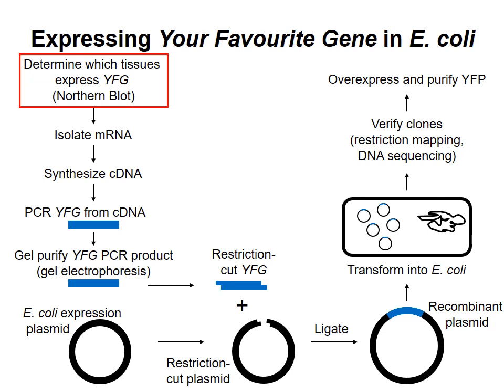So instead of trying to clone the DNA, it's a better strategy to clone the mature messenger RNA after the introns have been spliced out. Therefore, we want to find a tissue type in which our mRNA of interest is abundant.